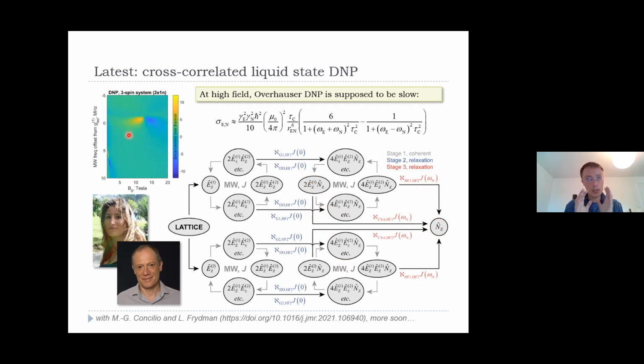So these are very narrowly specific, highly engineered spin systems. It remains to be seen if such systems can actually be synthesized. At the moment, it's a purely theoretical proposal. I understand Maria Grazia is working on it, but this is a situation where an entirely new phenomenon was first seen in a simulation, simply because the simulation has been implemented to treat absolutely everything.